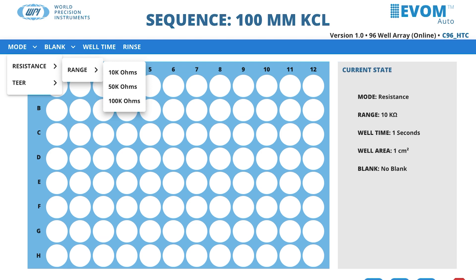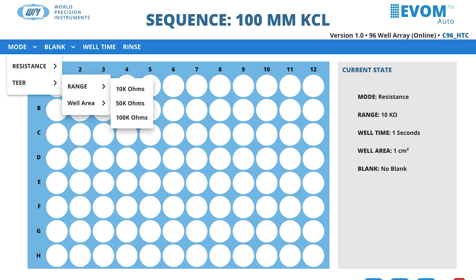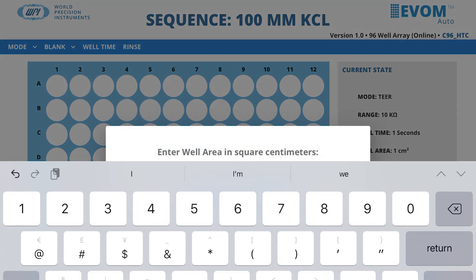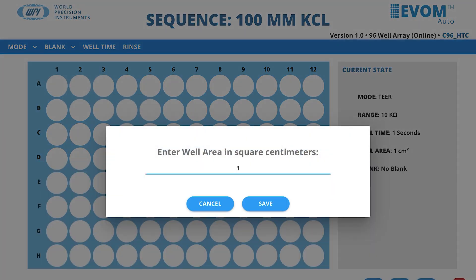When you select Mode Tier, you may choose the resistance range and the well area. The well area defines the surface area of a well on your plate.